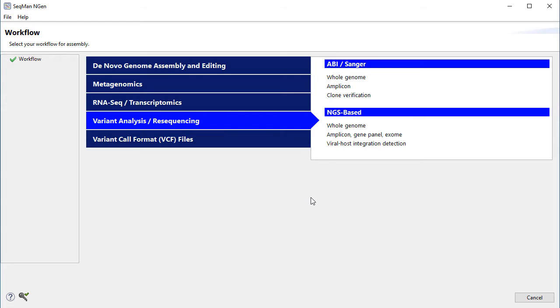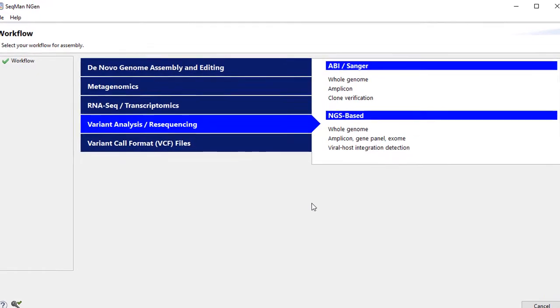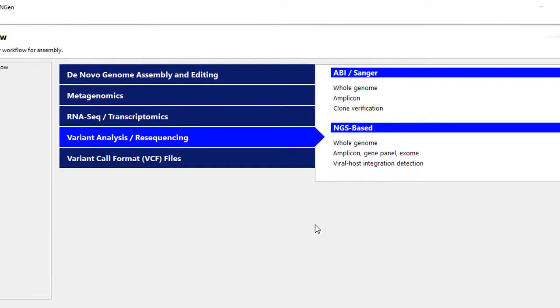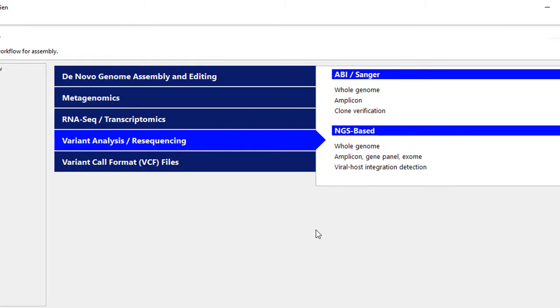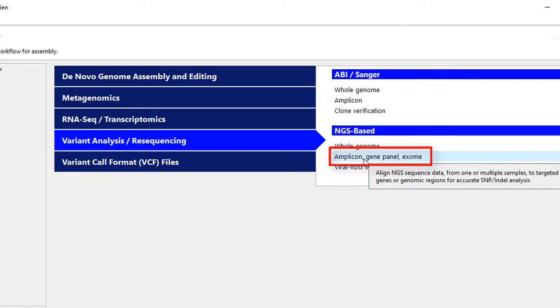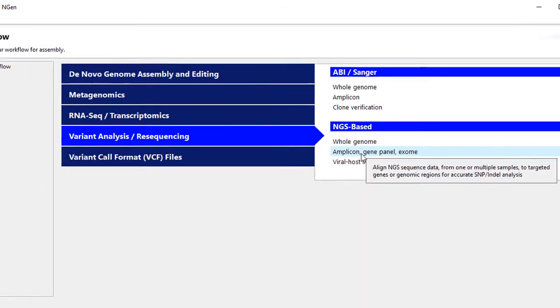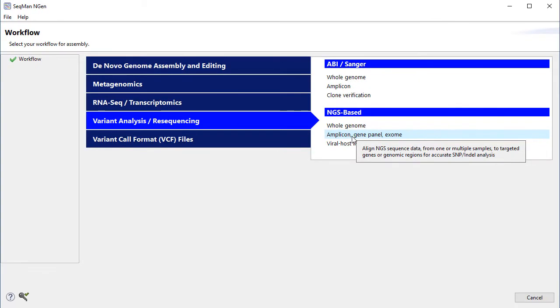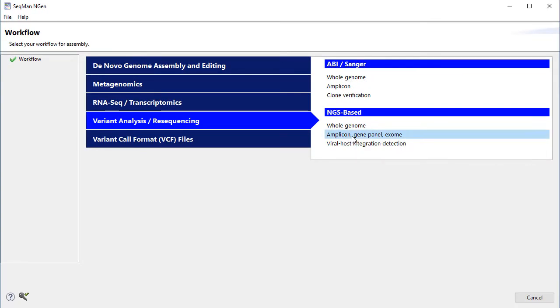To perform an exome or other targeted resequencing assembly, launch SeqMan Engine, then select Amplicon GenePanel Exome from the NGS-based variant analysis and resequencing workflows.